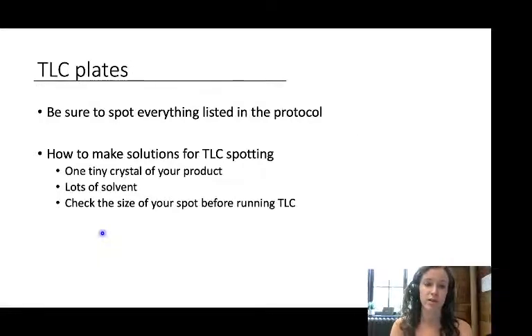Couple of notes from last week, folks. This is new for this week, but for this week, check your protocol. It is very specific about what we want you to spot on your TLC plates. But from last week, let's make sure to make some really nice dilute solutions for TLC. You need a tiny, tiny amount of product. One tiny crystal will do, or a very small drop if your product is a liquid. Dissolve that nicely in plenty of solvent.